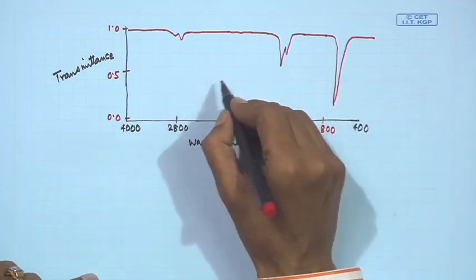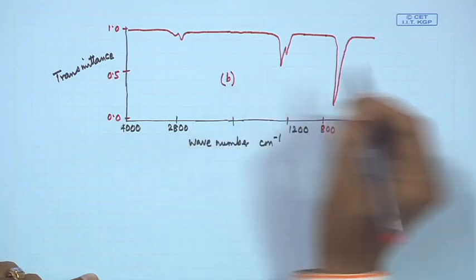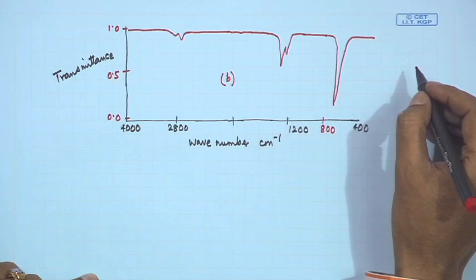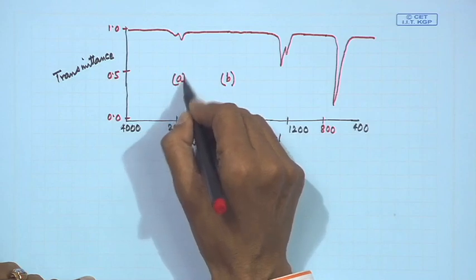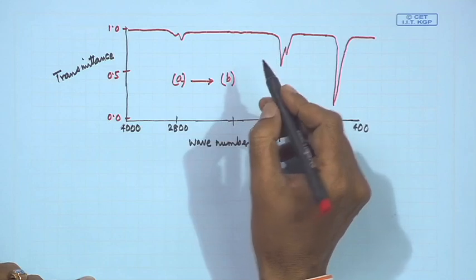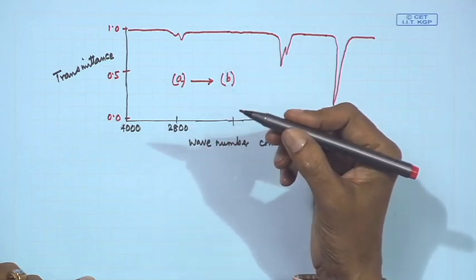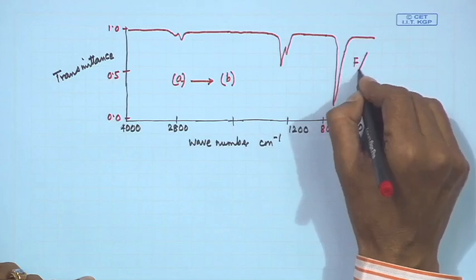Whatever data we obtained in the previous plot, that means time versus the detector response or the detector signal amplitude, can be converted. Earlier we have that A. So, how can we convert A to B? Earlier we talked about it as the interferogram. Now, it is the corresponding Fourier transformation.